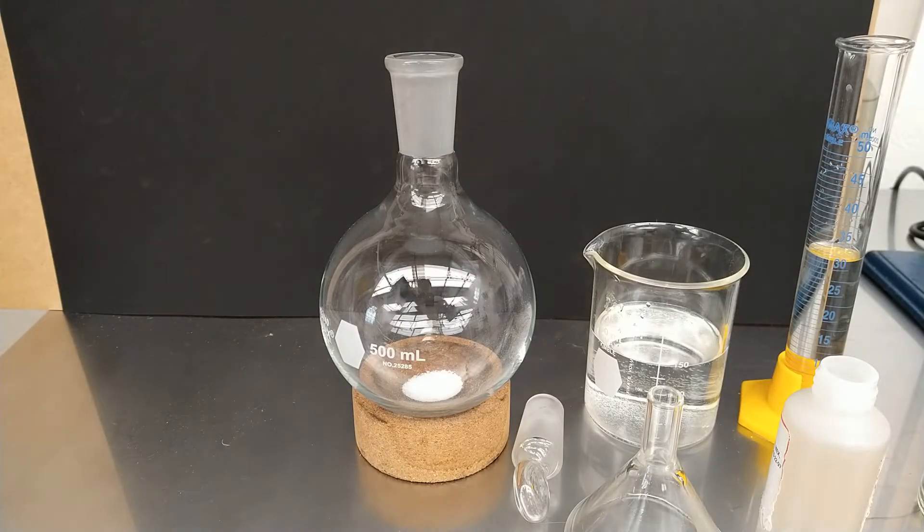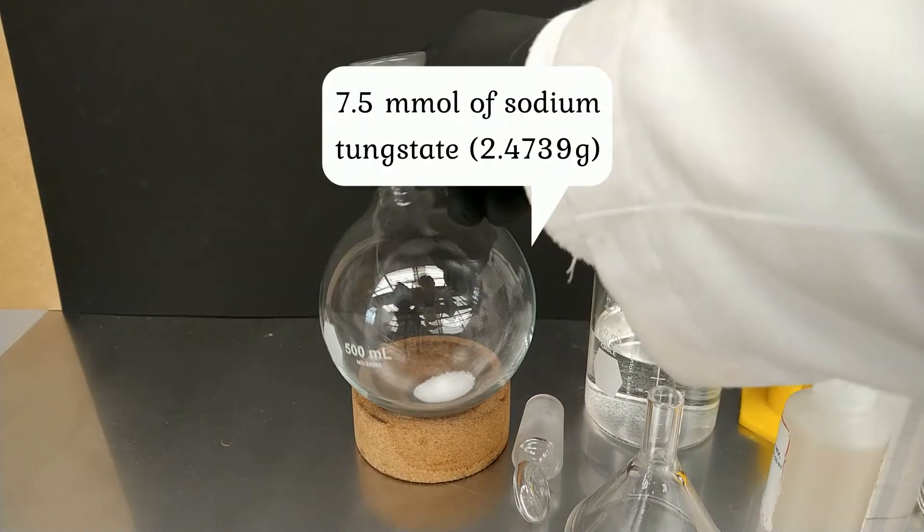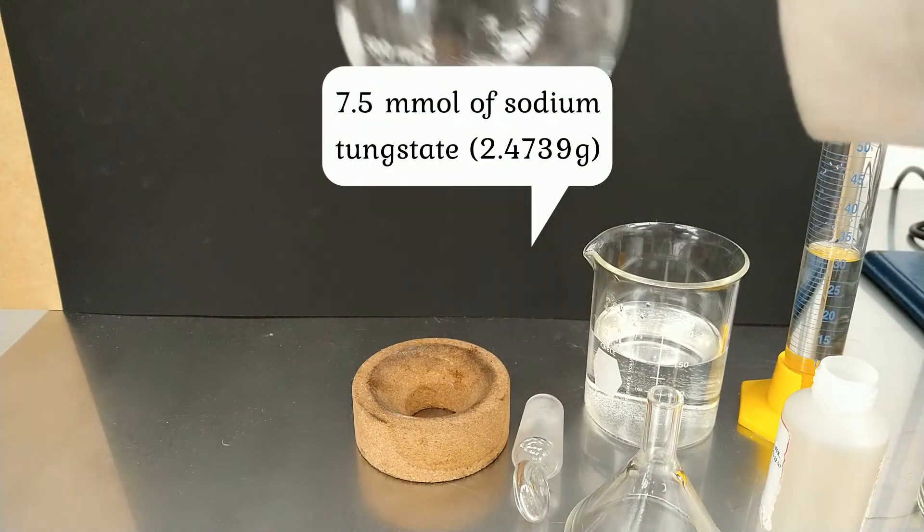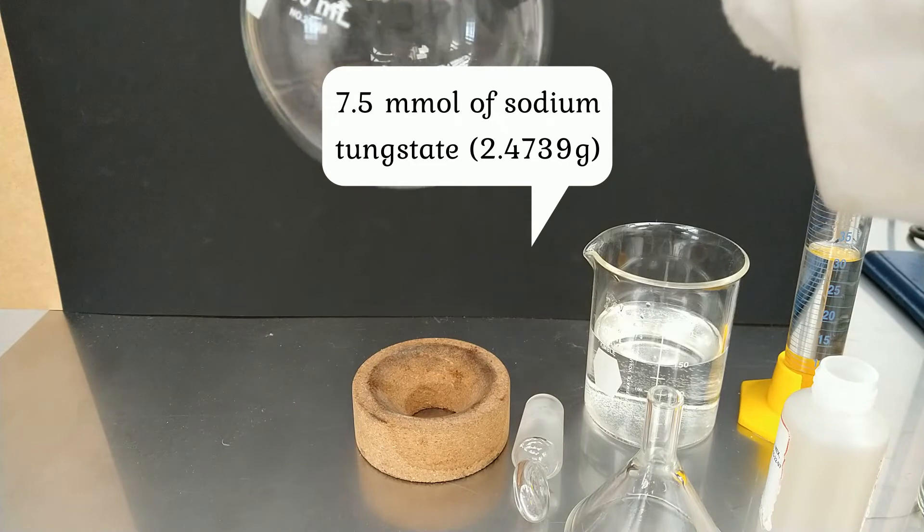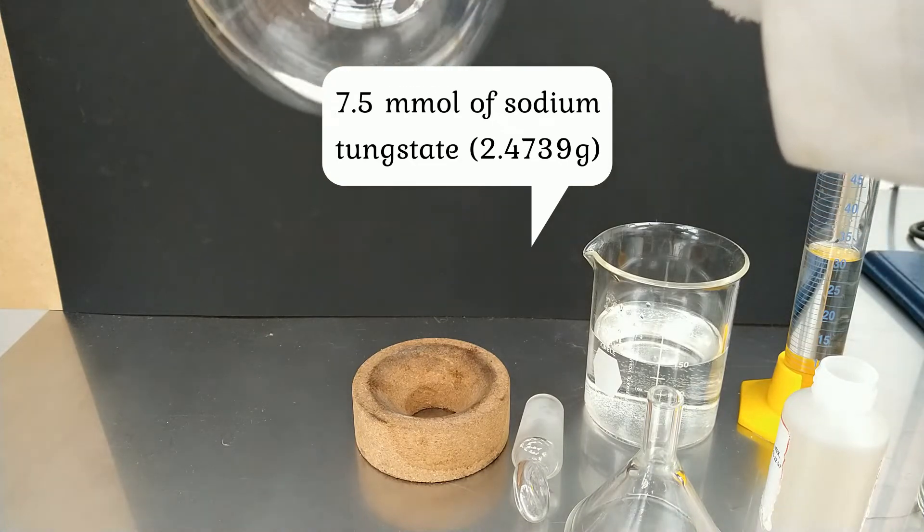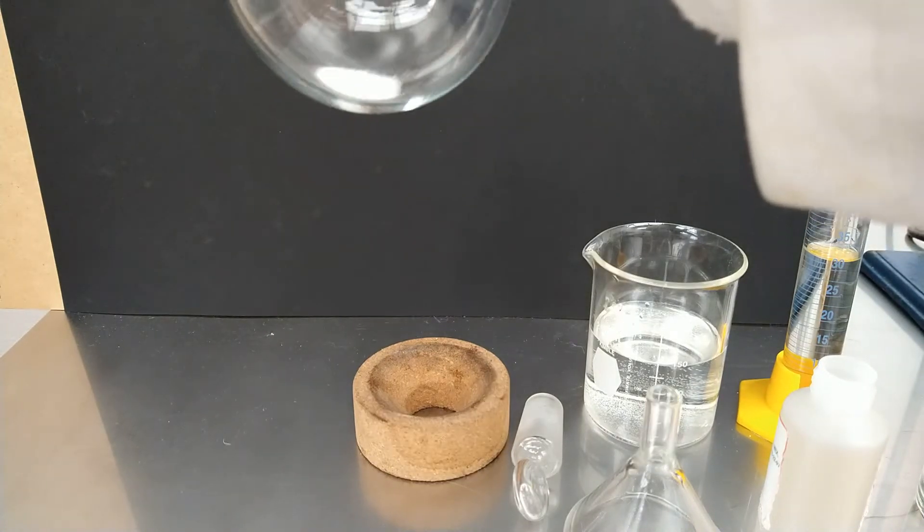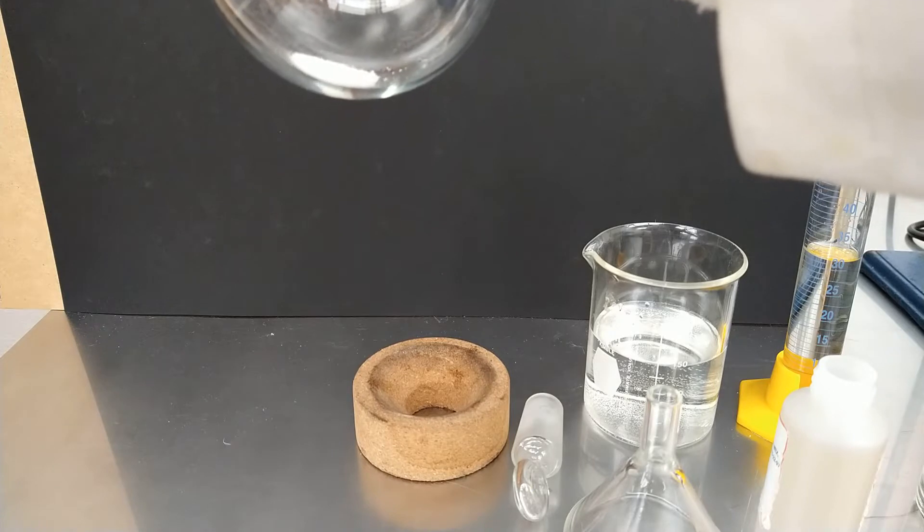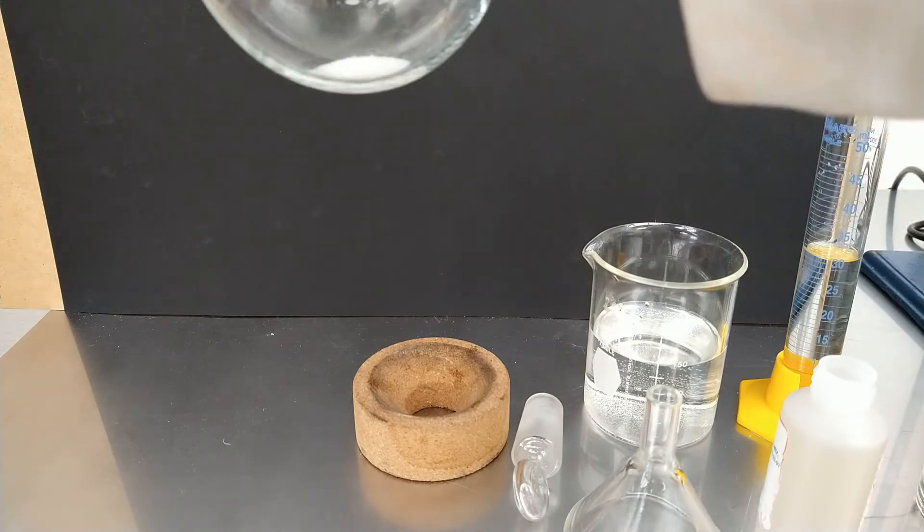To begin with the reaction, we have in this flask already measured 7.5 mmol of sodium tungstate dihydrate, that is equal to 2.47 g of sodium tungstate.